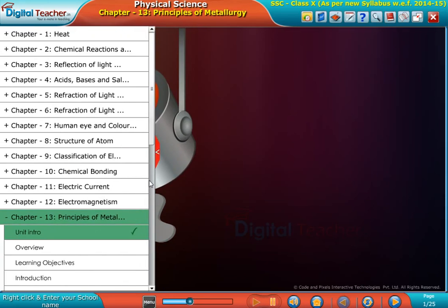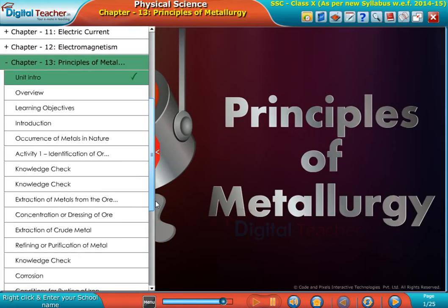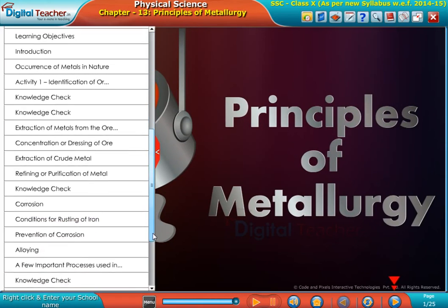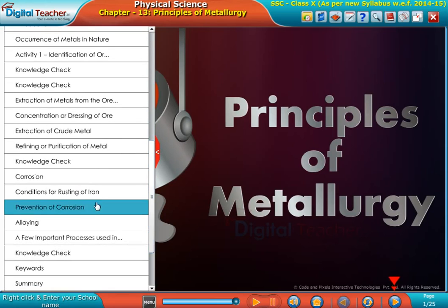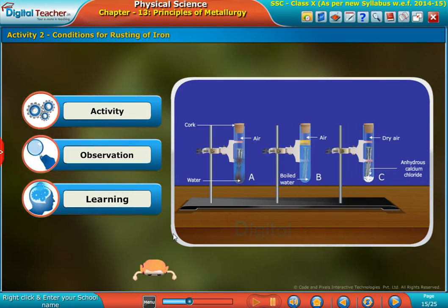Welcome to the chapter Principles of Metallurgy. Let us do an activity to know the conditions for rusting of iron.